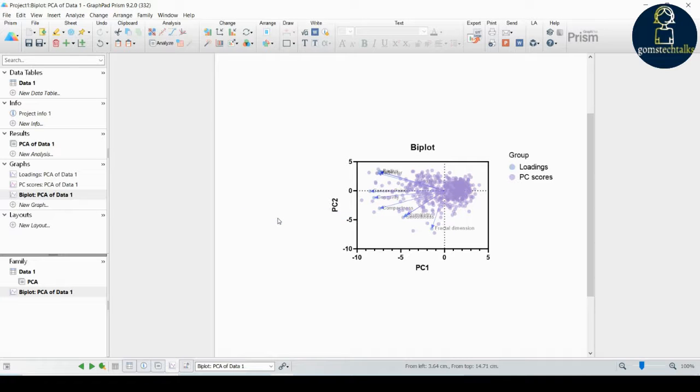The thing is, you have to select the right data set, and then simply you can come here and select what type of test you can do. And if you want to know more about the test, you can also do that. That is also possible here.